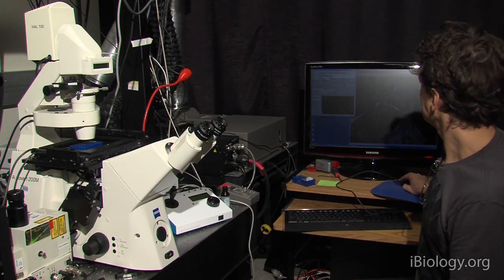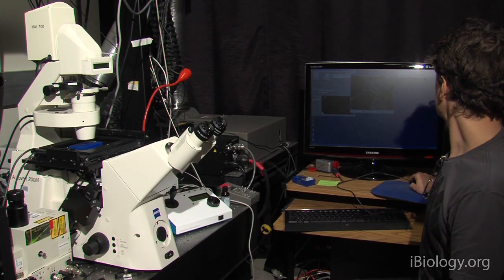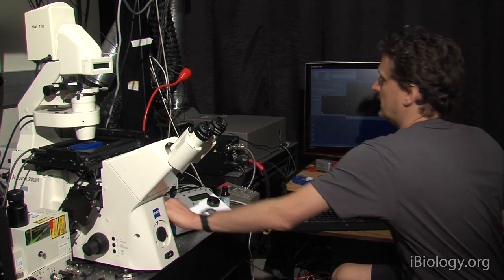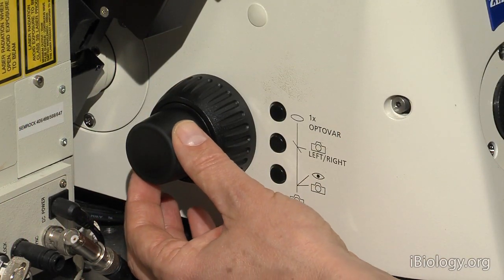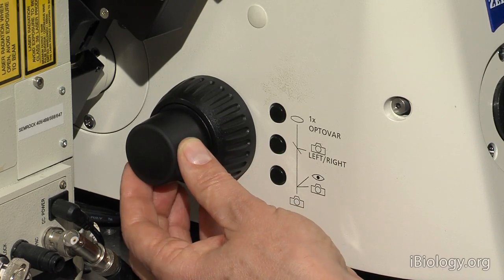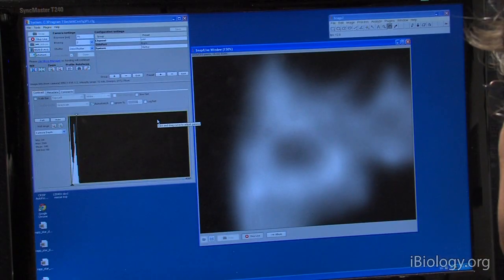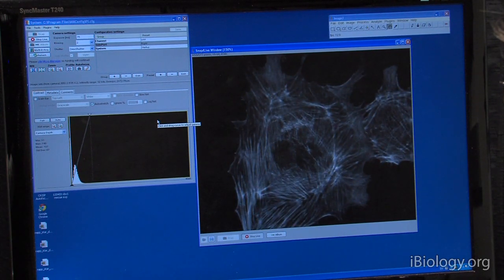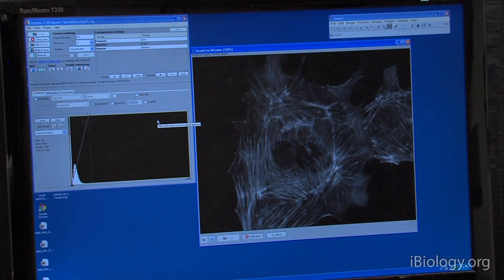Okay, so I'm now going to first focus the image on the camera. I use the software, I now use the focus, the fine focusing knob and I make sure that my image is more or less focused on the camera.